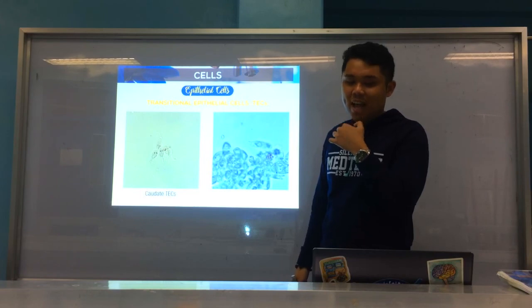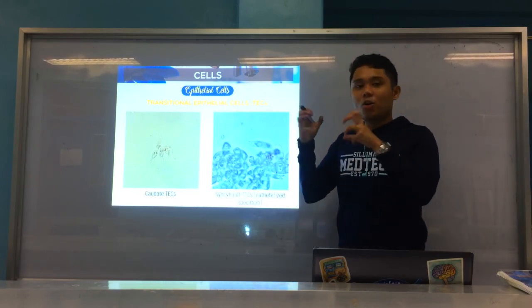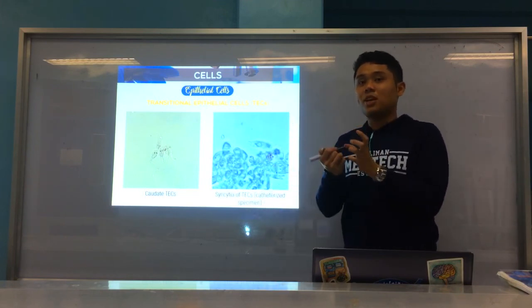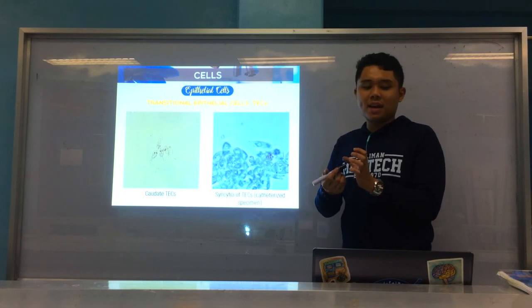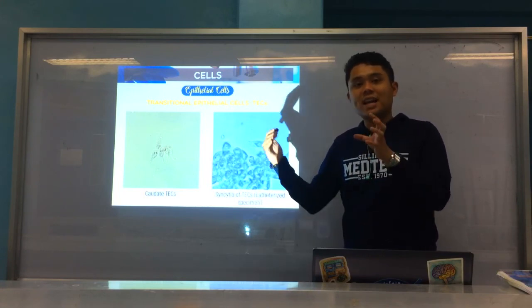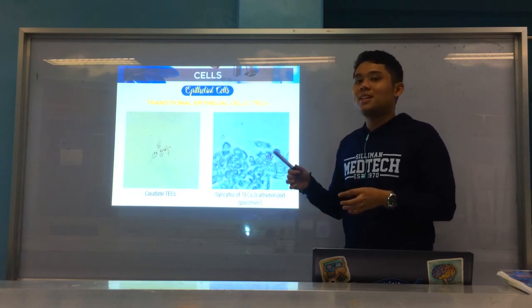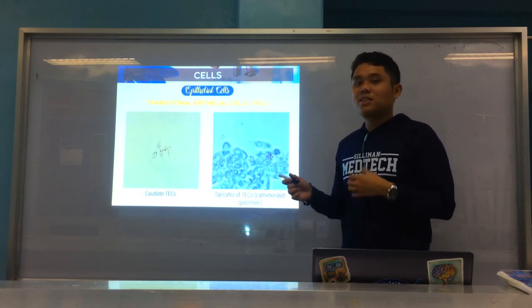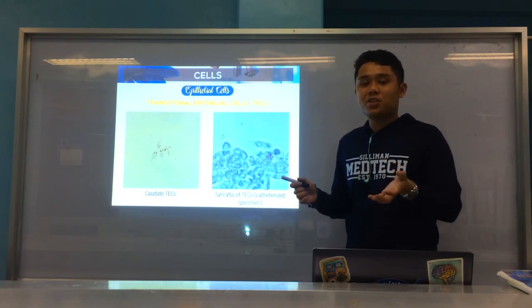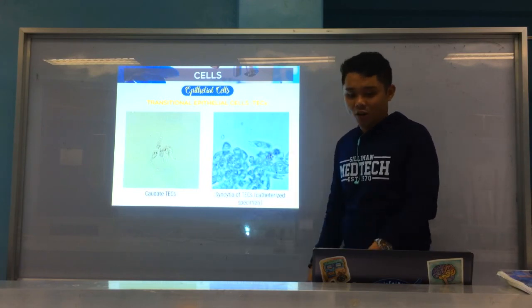That's a transitional epithelial cell. And the next one is syncytia, meaning clumped together. Where does it come from? A catheterized specimen. Because again, it's an invasive procedure, so the insertion of the catheter could cause shedding of many transitional epithelial cells. Okay, so if transitional epithelial cells are increased, it could be indicative of an invasive procedure, such as catheterization. Okay? Alright.